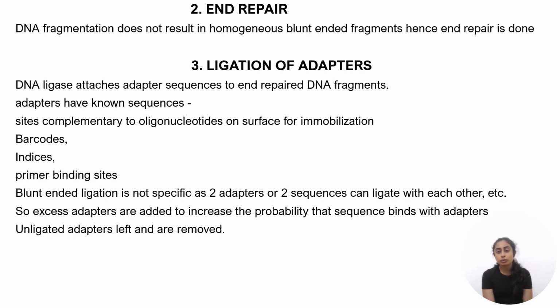So for example, if you are sequencing the DNA of 3 or 4 organisms together and you want to be able to differentiate which organism's sequence is the result that you're getting, you attach adapter number 1 to organism number one's DNA, however many fragments you have. You attach adapter number one to all the sequences of organism number one. Similarly, adapter number two to all the sequences of organism number two, and so on. So that helps it act like an index, a barcode basically.